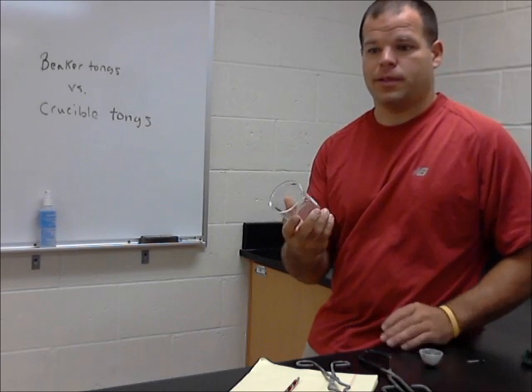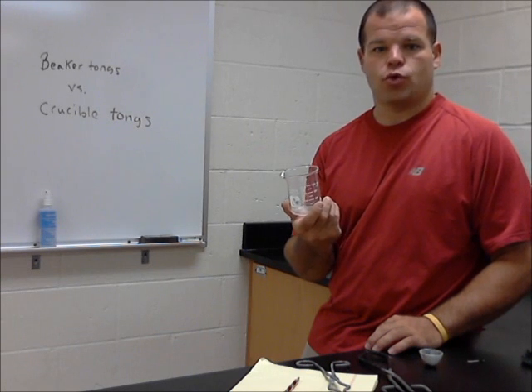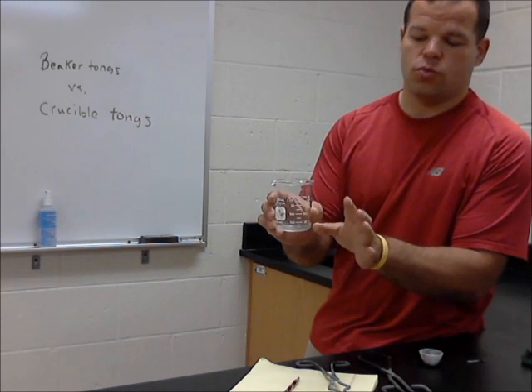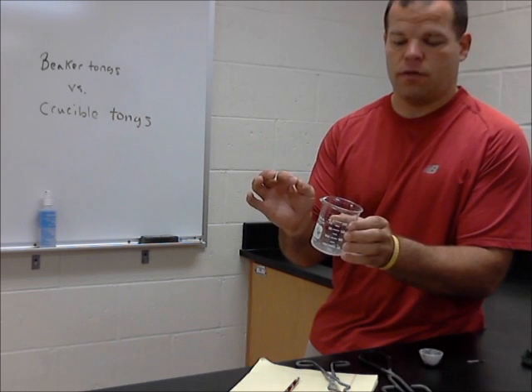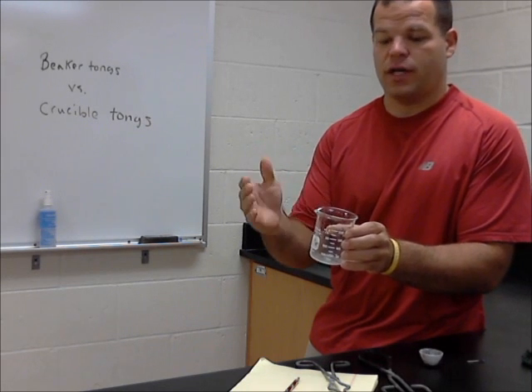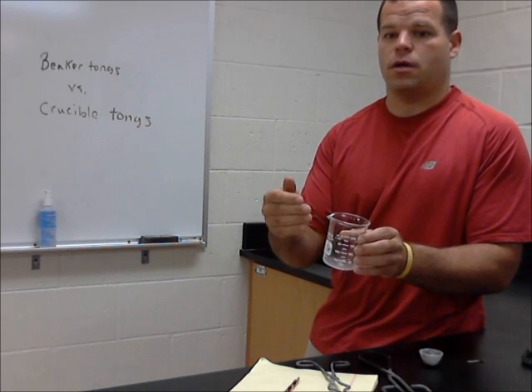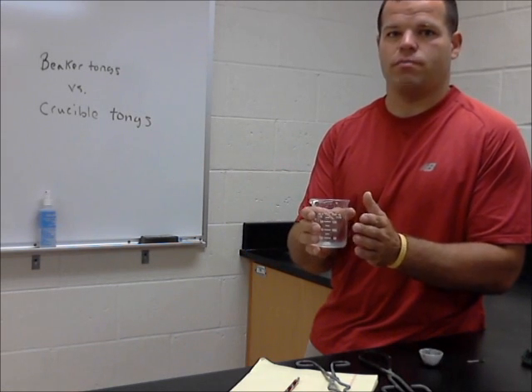A beaker is probably the number one tool that you would use in a lab. On a beaker you'll see various degrees of measurement. Just so you know, these are very rough measurements. If you wanted an exact, very accurate amount of water, you would use a different device. You would never use a beaker for a very specific measurement of liquid. A graduated cylinder or a graduated pipette are other ways of getting a certain amount of liquid. This is just for rough measurements only.